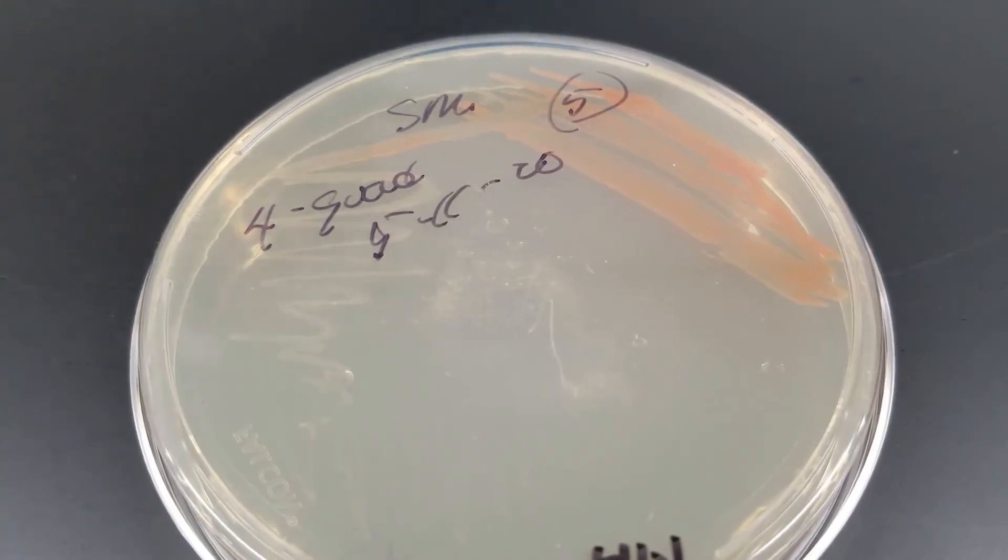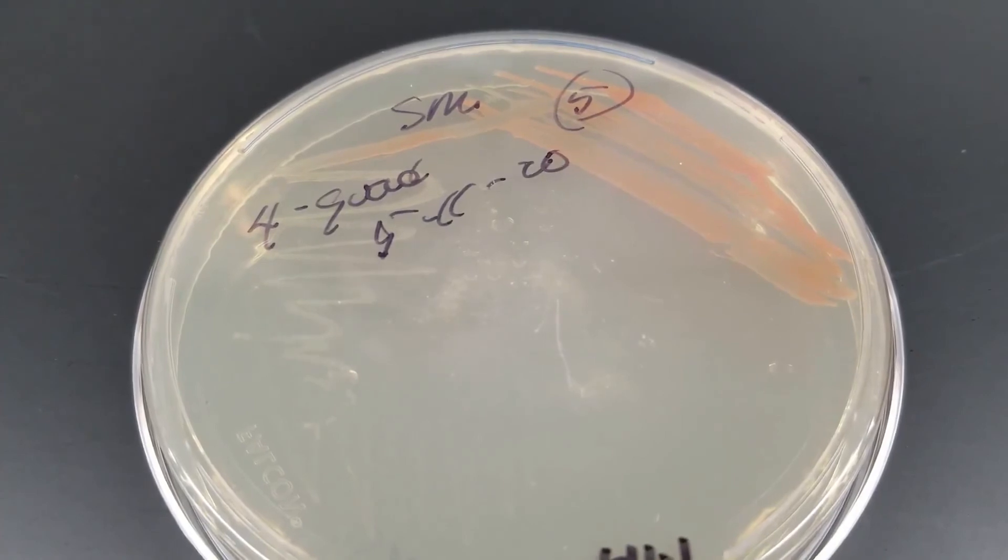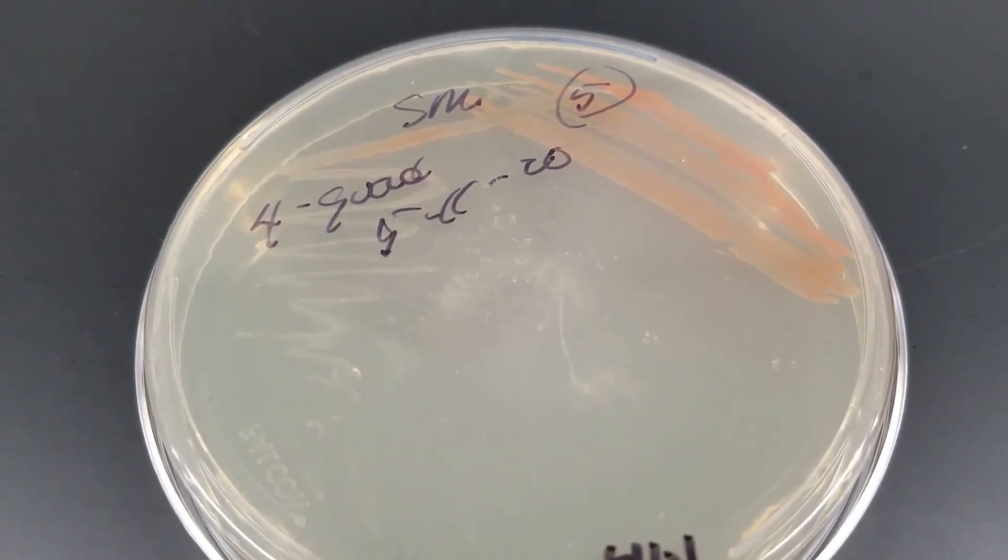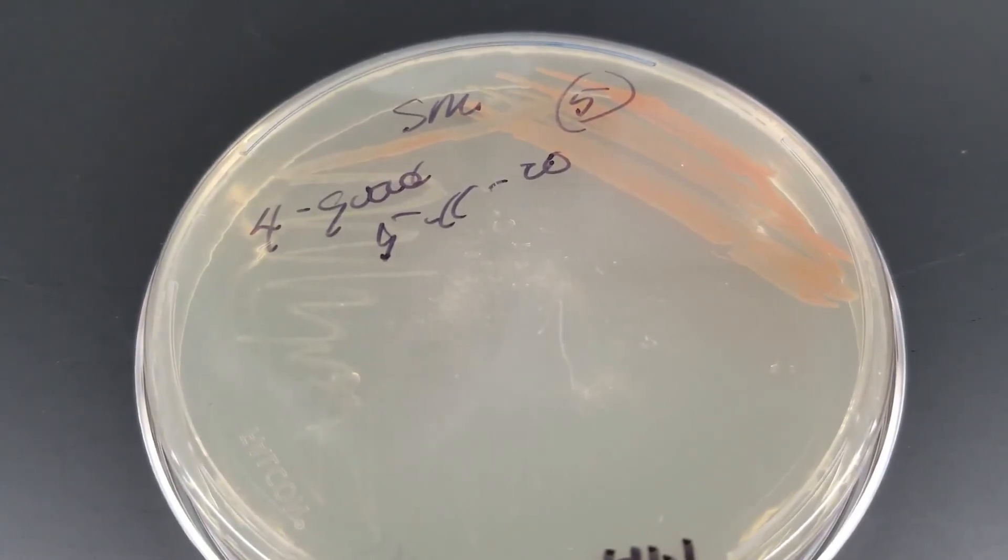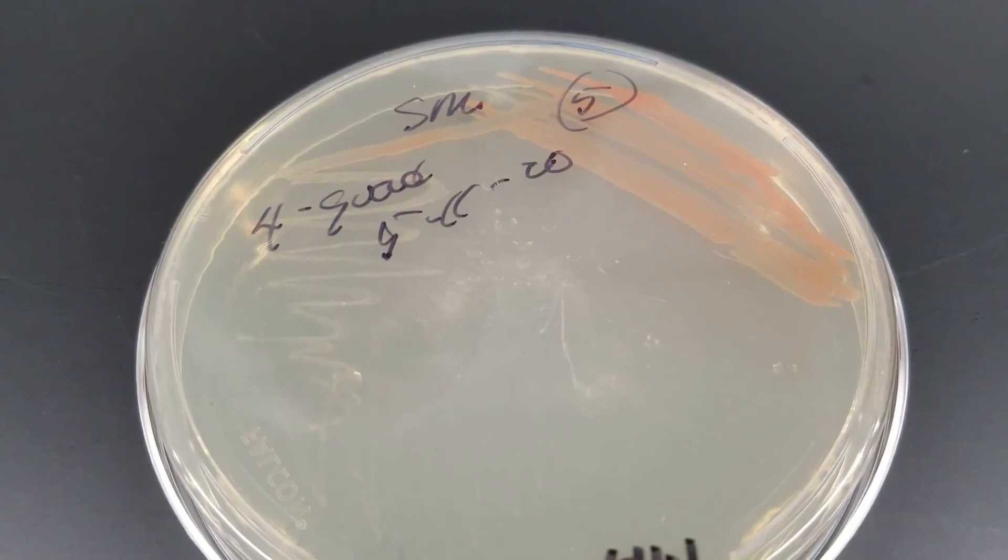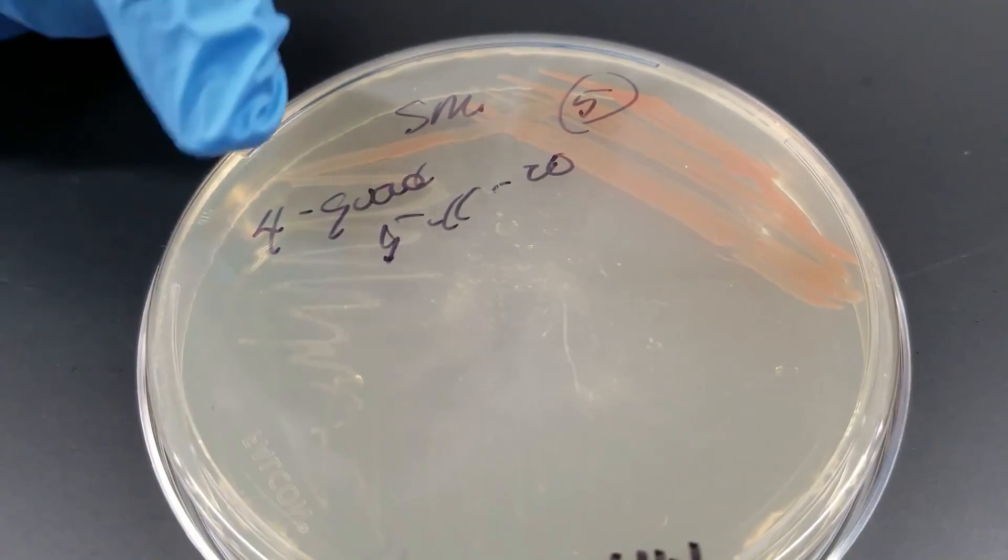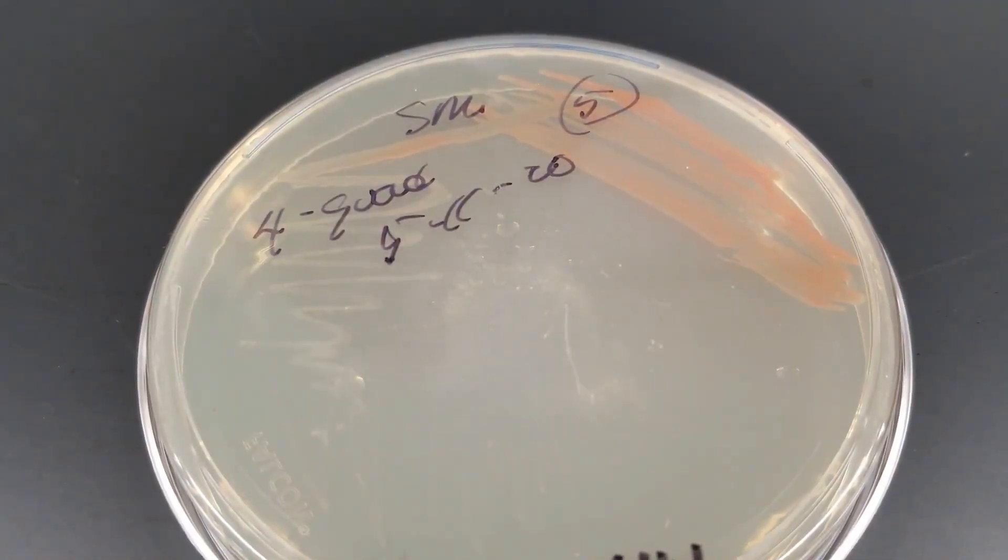A colony looks like a little circle on here, and that represents one bacteria. Now what you're seeing is actually millions, but it arose from one single individual bacteria. So it would be considered a pure colony when you have just that one tiny little colony, and look towards the end, and that's where you're going to find them on both of these.